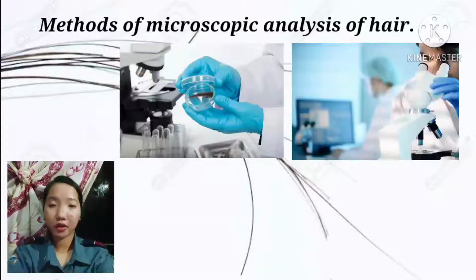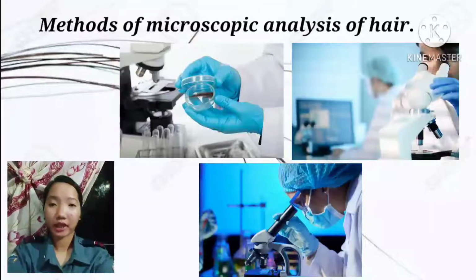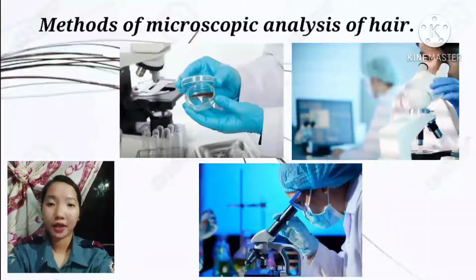Then we have also the microscopic hair comparison in forensic laboratories. So dito is usually 2 compound microscope ang kailangan na connected sa questioned hair and known hair origin in the same field of view.